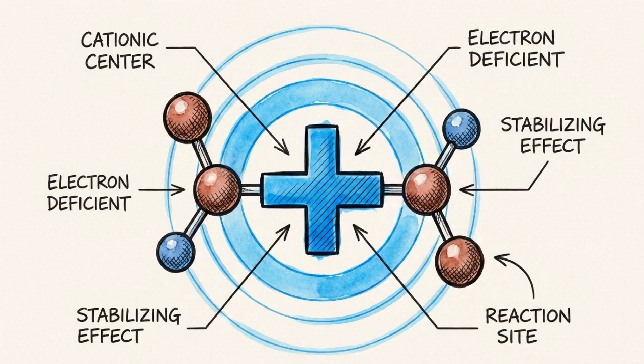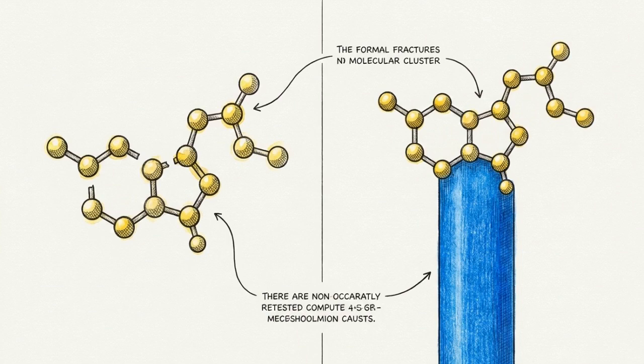In mass spectrometry, stability describes how well a fragment can support its positive charge. The more stable a fragment is, the more likely it is to survive the journey to the detector, and the taller its peak will be.